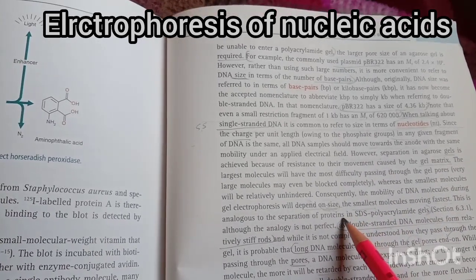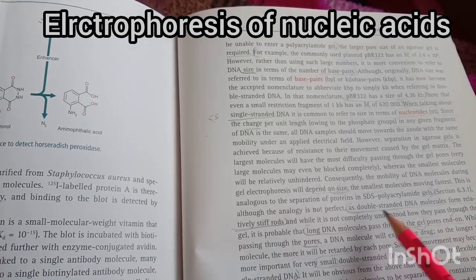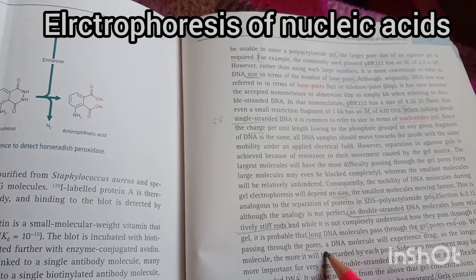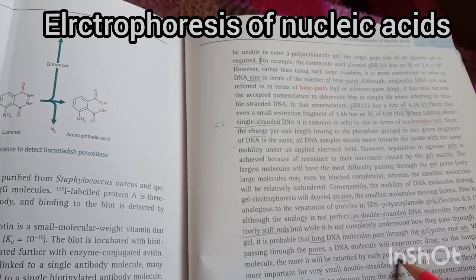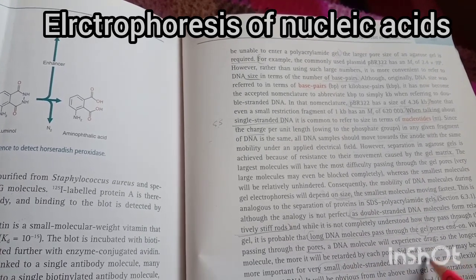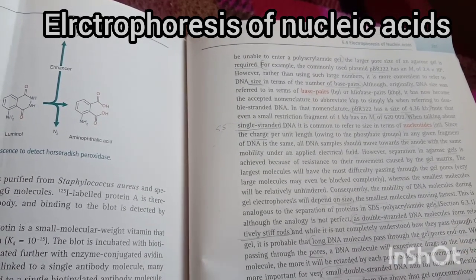Now if we talk about double stranded DNA molecules, they form relatively stiff rods. Longer molecules pass end on, and passing through the pore, the DNA molecule will experience drag. So the longer molecules are retarded more by each pore, and the small double-stranded DNA molecules show sideways movement. The sideways movements will be more flexible in single-stranded DNA.